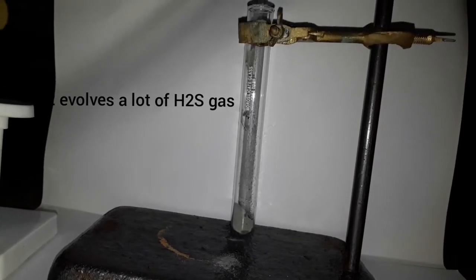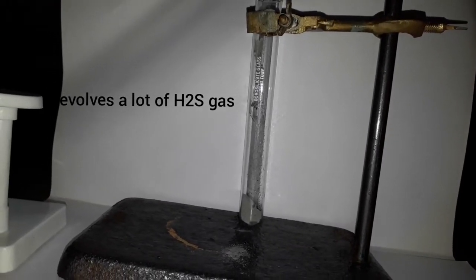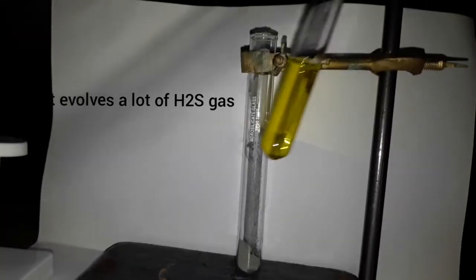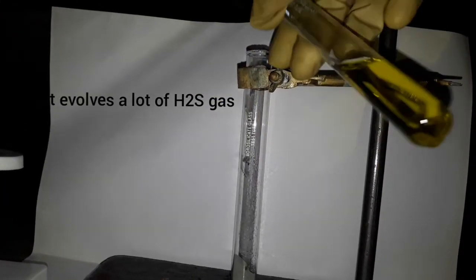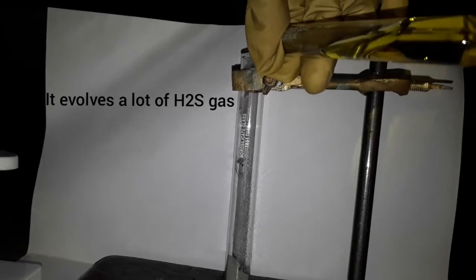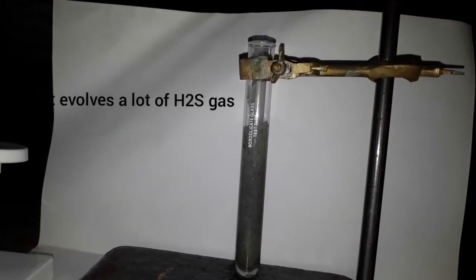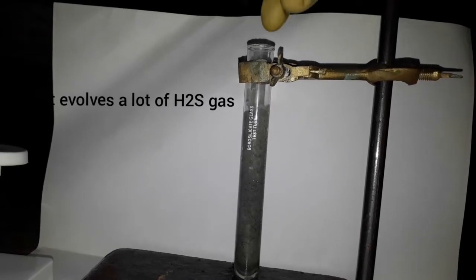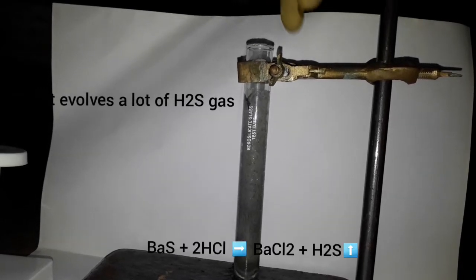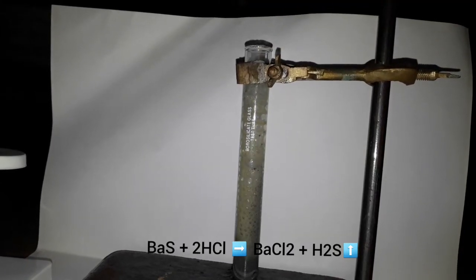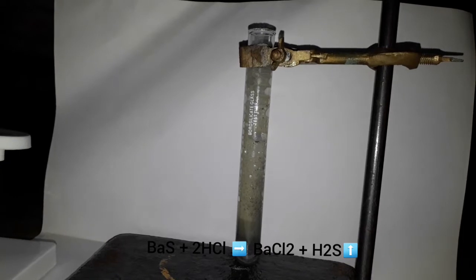Now we have hydrochloric acid. When poured, this produces a lot of hydrogen sulfide gas and barium chloride. Both are toxic, and hydrogen sulfide has the smell of rotten eggs.